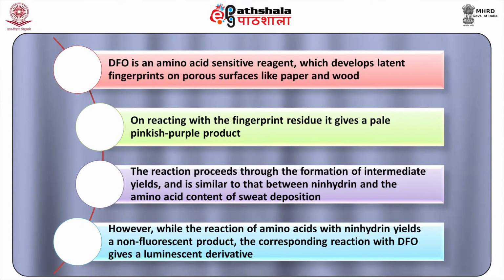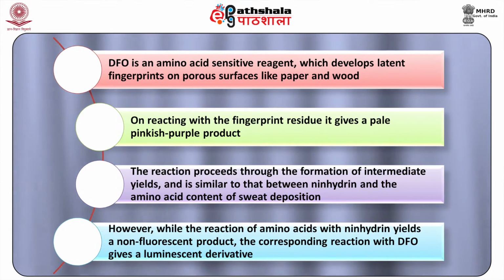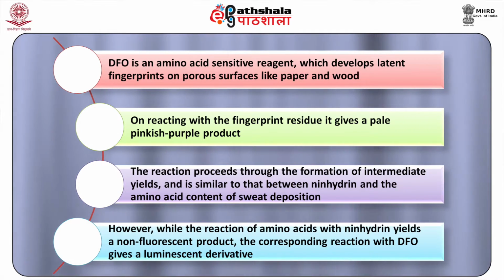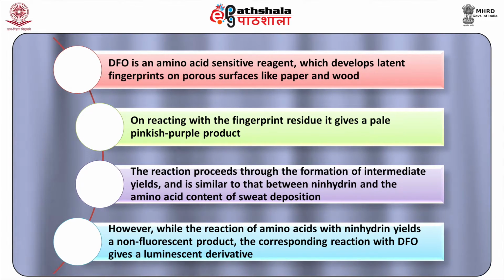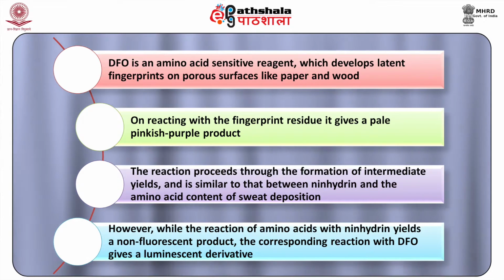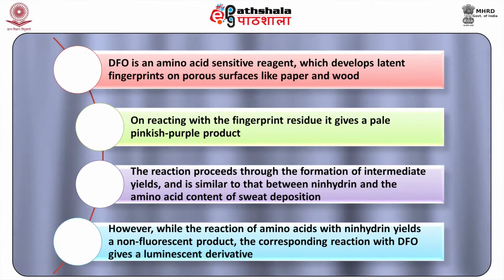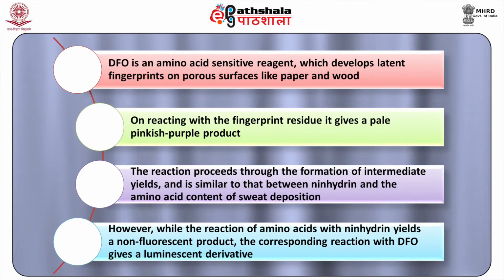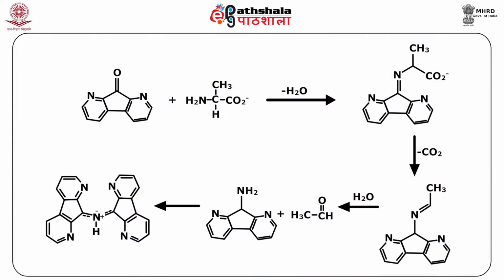DFO is an amino acid sensitive reagent which develops latent fingerprints on porous surfaces like paper and wood. On reacting with the fingerprint residues, it gives a pale pinkish purple product. The reaction proceeds through the formation of intermediate ylides and is similar to that between ninhydrin and the amino acid content of sweat deposition. However, while the reaction of amino acids with ninhydrin yields a non-fluorescent product, the corresponding reaction with DFO gives a luminescent derivative. The mechanism of reaction between DFO and amino acid residue leading to the fluorescent product is depicted.